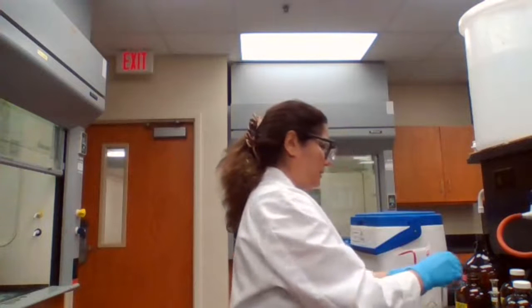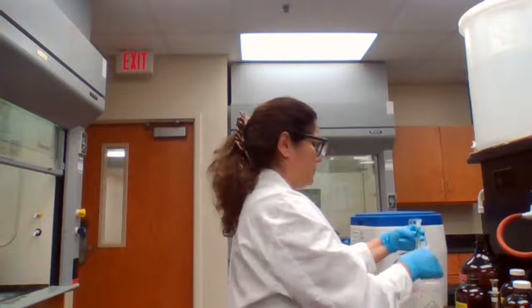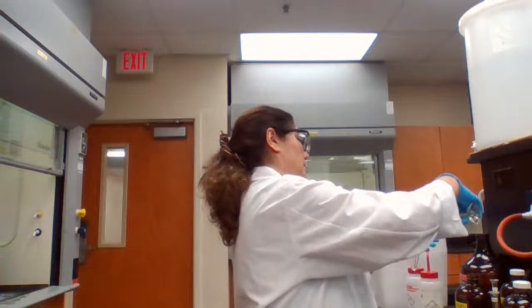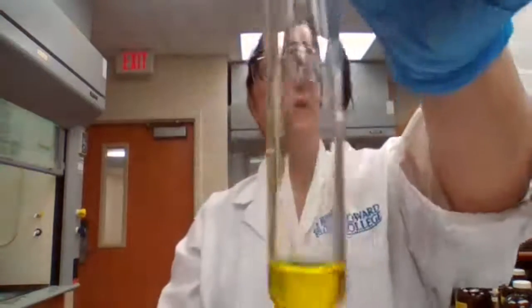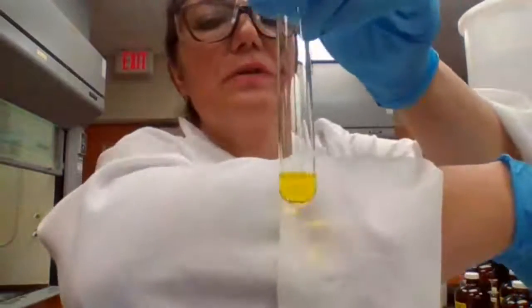We're adding 1 milliliter of potassium chromate. I added 1 milliliter of potassium chromate into a clean test tube, and I want you to record the color. So with the white background, record the color.